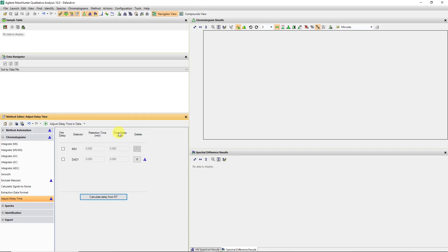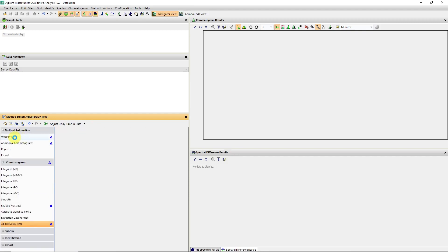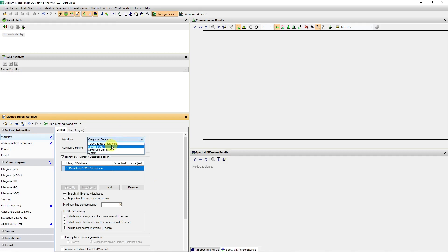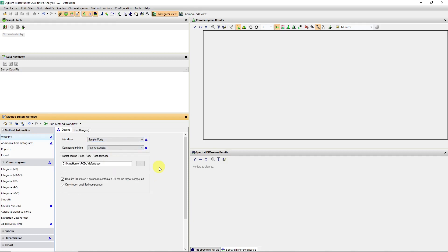I want to show you how we do a sample purity calculation if we have any UV data. There are a few ways we can do this. I'd like to start with a manual calculation so you understand the principles of how the program is doing this, and then we can go over to an automated fashion. So it's a mass-directed purity analysis utilizing the information of a given formula or mass, which is input by the user and relayed to the UV chromatogram.